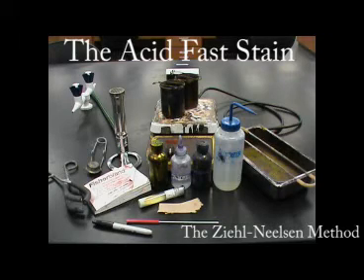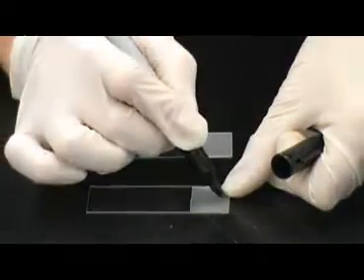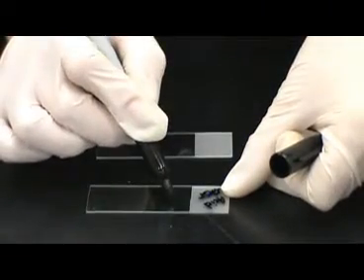The acid-fast stain using the Ziehl-Neelsen method. To begin the acid-fast stain, you must first prepare your slide. Using one glass slide, label it Acid Fast.